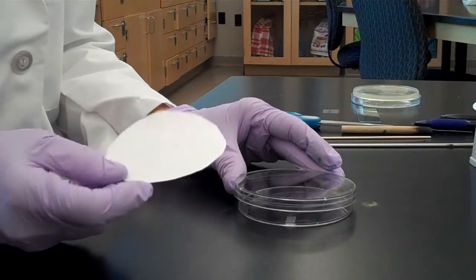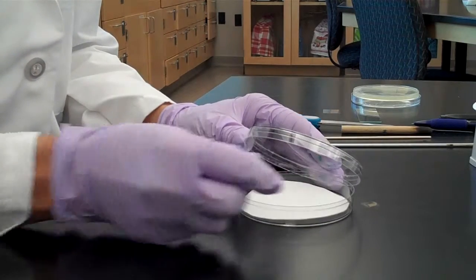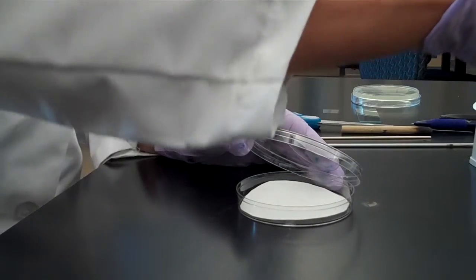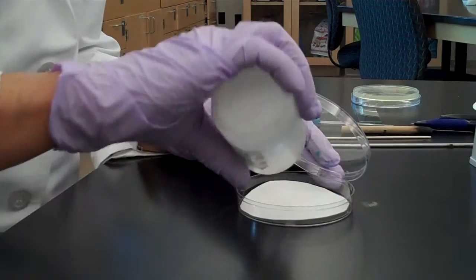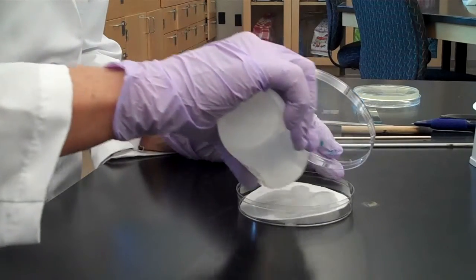Obtain a piece of filter paper and trim it to fit into the petri dish. Add a few drops of deionized water and make sure that filter paper is fully saturated.